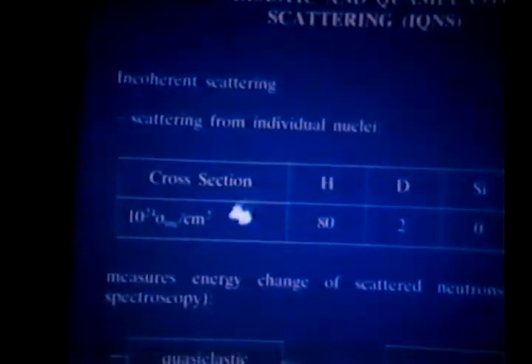Now we turn to this quasi-elastic scattering technique. Peter's already mentioned that the probe here, where we're looking at scattering from the protons, the hydrogen atoms in the system, gives very strong scattering because the cross-section is dominated by this nucleus compared with the other nuclei one might find in the system. Peter was talking about energy changes around 100 meV, corresponding to these librational modes. We'll be concerned with other intermolecular modes at much lower energy, which one can find out about using time-of-flight spectroscopy, and we'll describe briefly results made at Grenoble on the IN6 time-of-flight spectrometer. We'll also show what type of changes occur in this quasi-elastic region due to the dynamics of the water molecules themselves.